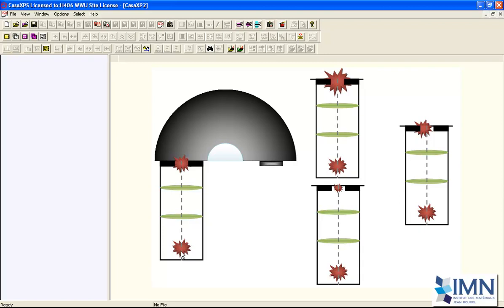And what we must have is the image formed here for both the fluorine 1s and the fluorine 2s must be identical if we expect to get peaks, which we can then scale by the Scofield cross sections so that we end up with comparable signal for fluorine once scaled. So how could this go wrong?